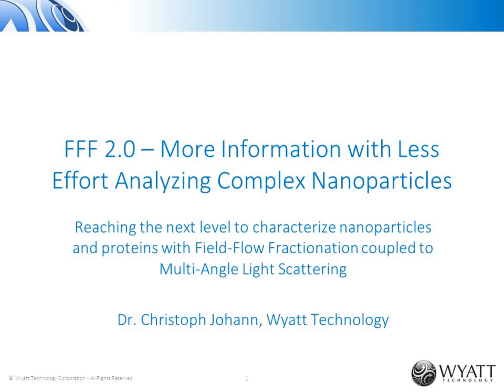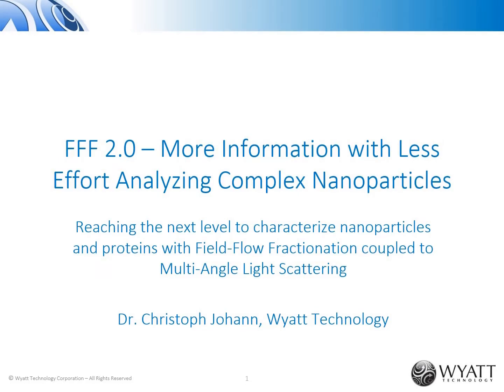Many thanks to the moderator for the kind introduction. In today's webinar, I want to discuss with you how we can get more information with less effort analyzing complex nanoparticles using FFF.